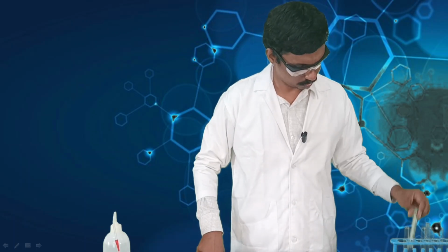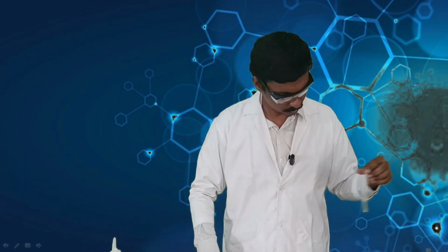If it's soluble in water upon heating, then it tells you that it's an acid, which can be a dicarboxylic acid or a monocarboxylic acid. I just demonstrated to you during our litmus test that the organic compound which did not dissolve in cold water dissolved upon heating.